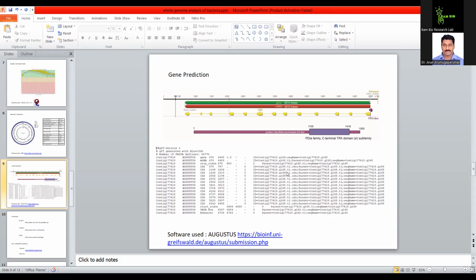You can give any information. For example, any mutation in the feature, you can type it here. Or any special sequence name also, you can give it in the 9th column. So this is called a GFF3 file. This file can be parsed by any bioinformatics software and they can produce a diagram like the one you see at the top. You cannot port this diagram anywhere, but this text format is highly portable.